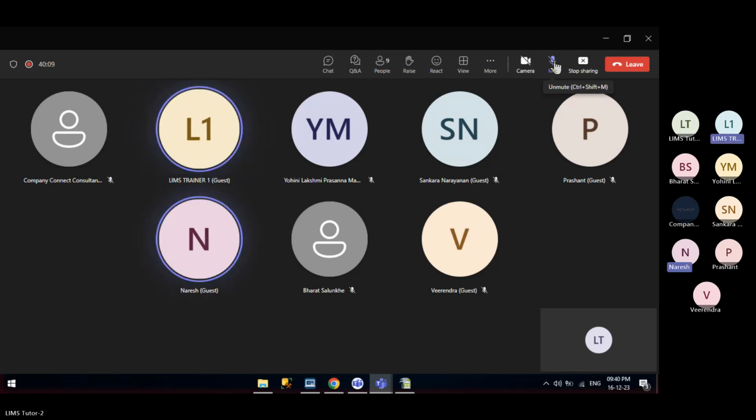So it is not a fully fixed one. It is fully customizable and configurable. As per your requirements, you need to design the report, because I will have some requirements, you will have some requirements, and some other organization will have other requirements. As per their organization requirements, they will design the Crystal reports, whatever data they want to show.